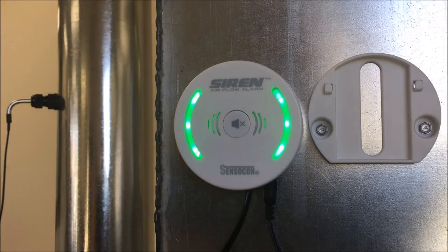The LEDs will remain solid green if the air velocity is above the alarm point. Should the air velocity drop below 80% of the operational velocity, the LEDs will flash red and an alarm will sound.